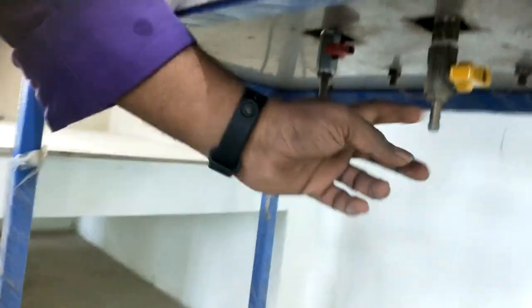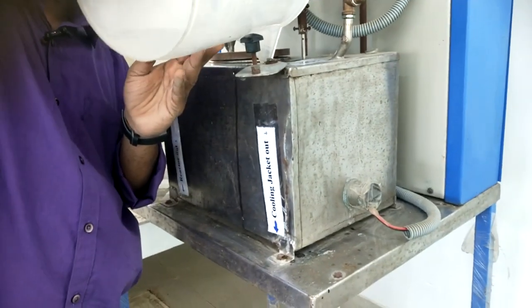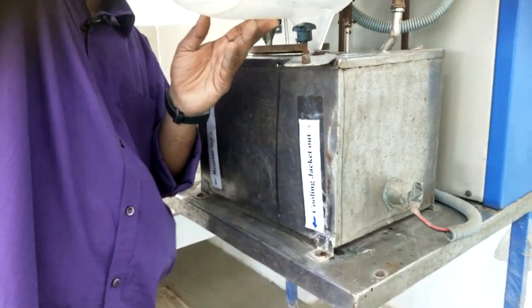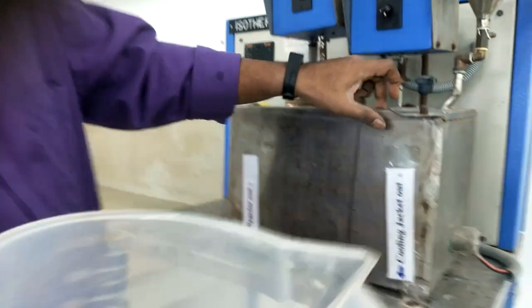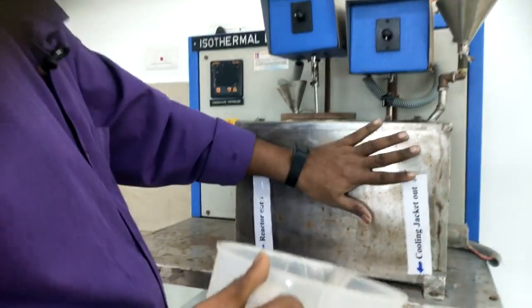This is the cooling water inlet, and we have a valve here which we have to close, the cooling water jacket outlet. So we'll once refill this water. Now the water level is up to here, sufficient. We have full water in the cooling jacket.